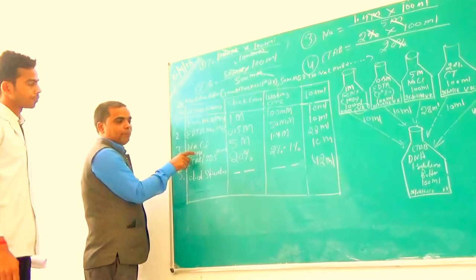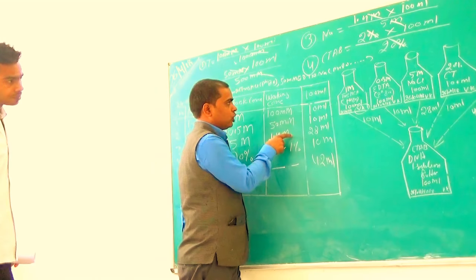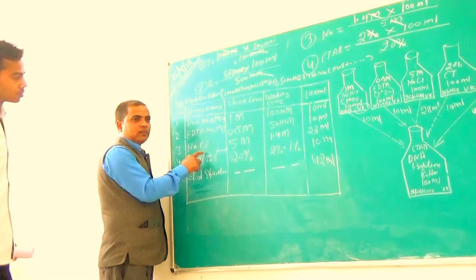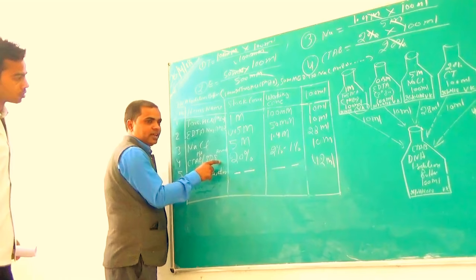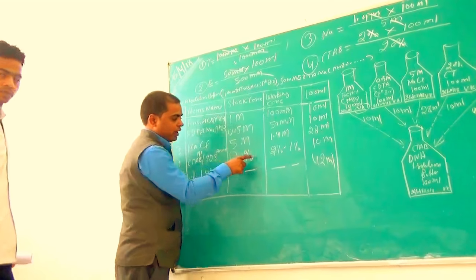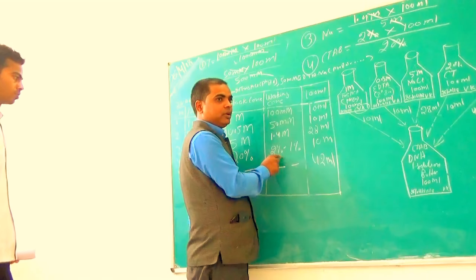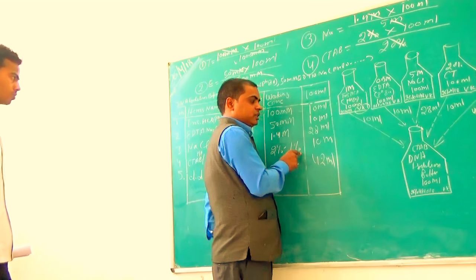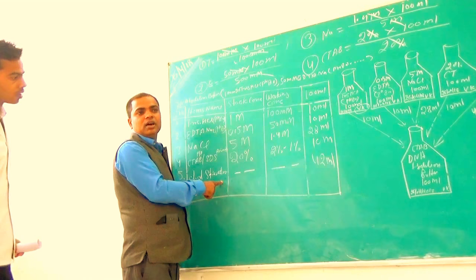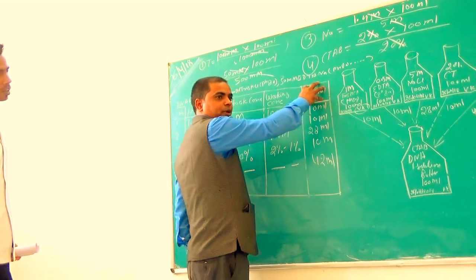Third compound is NaCl, 5 molar stock, 1.4 molar working concentration. CTAB is used for plant and fungal DNA. SDS is used for all kinds of animal DNA isolation. 20% is the stock solution and the working solution is 2% for CTAB, 1% for SDS. And double distilled sterile water is used to maintain the volume. Here is the 100 ml final volume of the preparation.